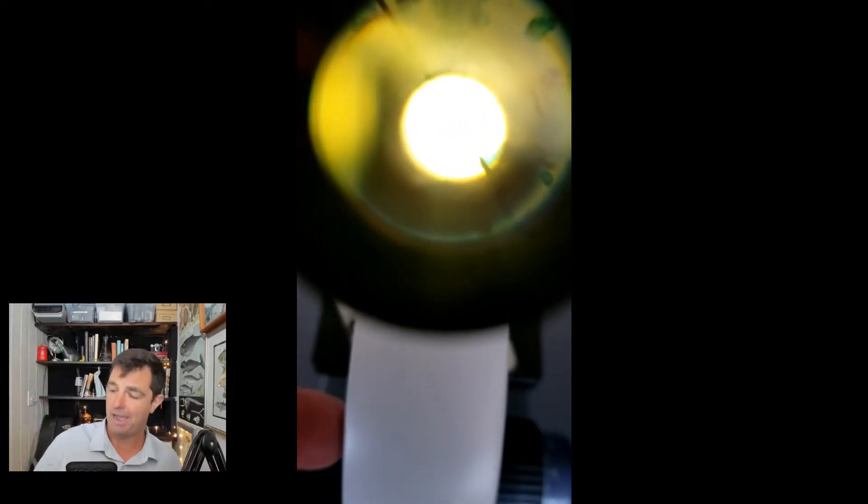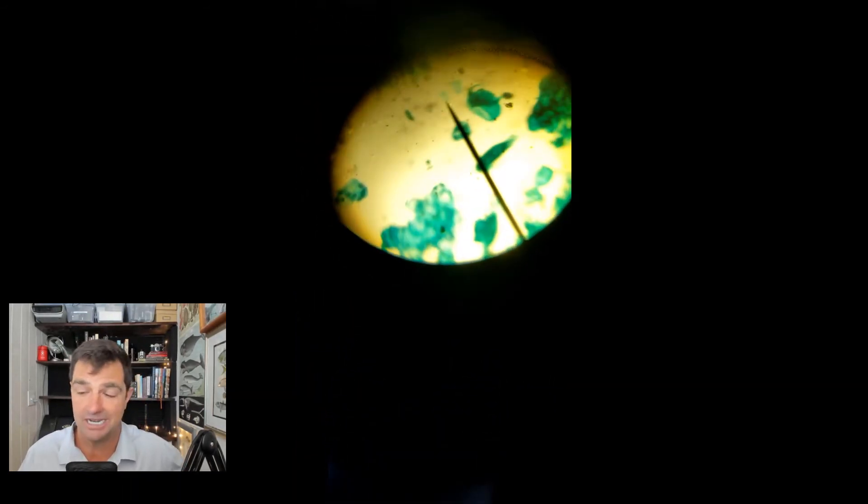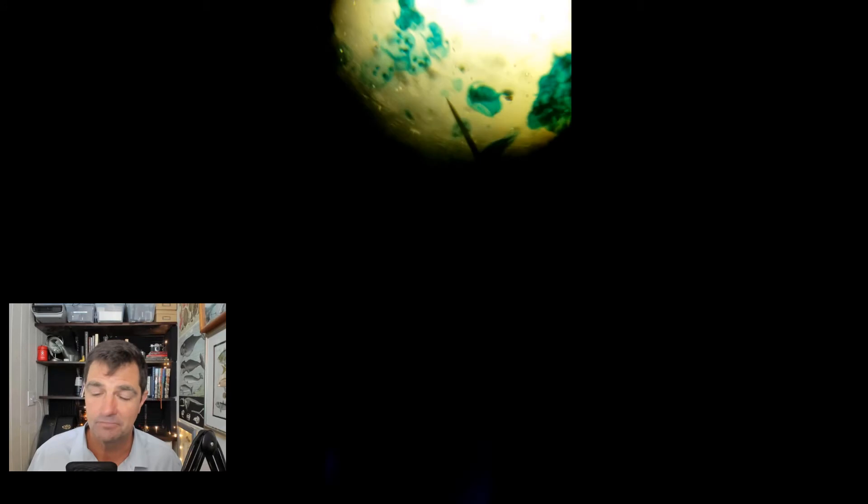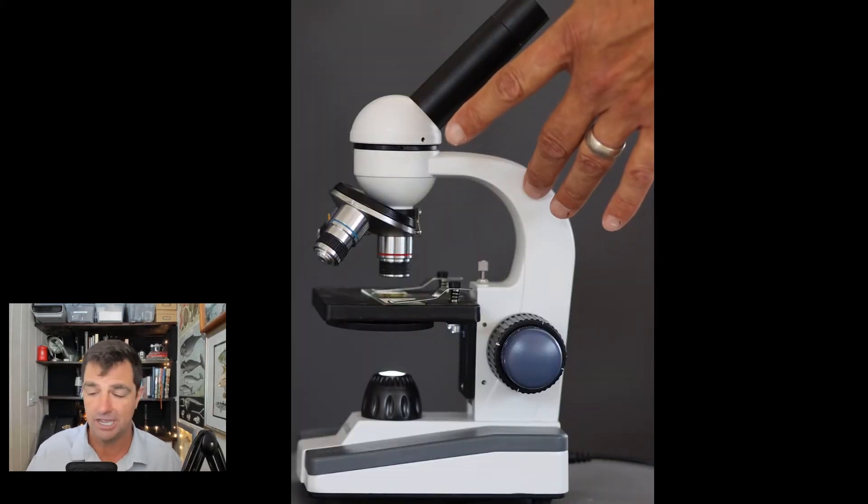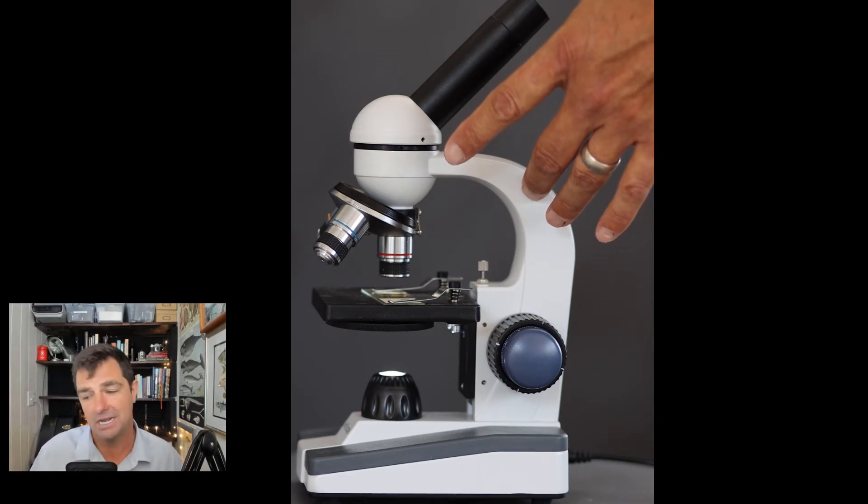There are things you can buy that allow you to mount to the microscope. But one thing my students taught me is that you can use your cell phone camera to take a picture directly through the microscope. Everybody's technique is a little bit different.